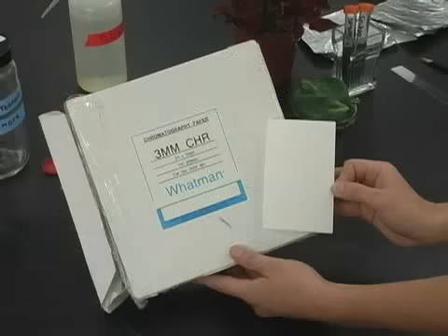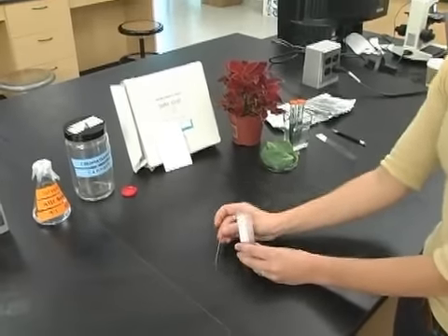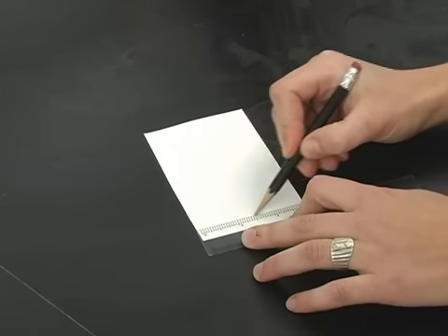Be careful to only touch the sides of the paper. This is so that you do not get grease or dirt on the front of the paper, as it will affect your results. And glass capillary tubes to put very precise drops of pigment extract onto the paper. Once you have assembled these materials, you will need to draw a line using a pencil a few millimeters from the bottom of your paper. This line will help you measure the rate of flow of your solvent and pigment.